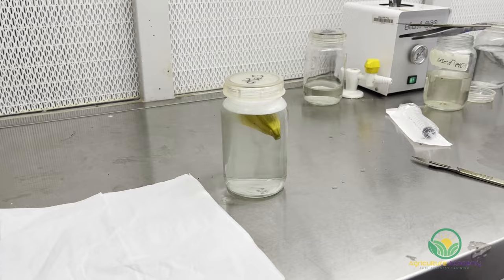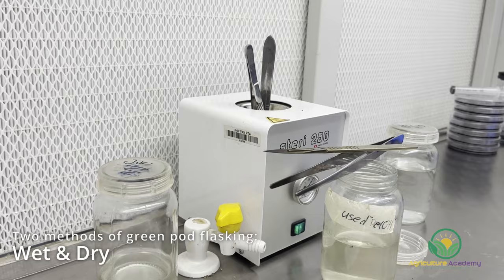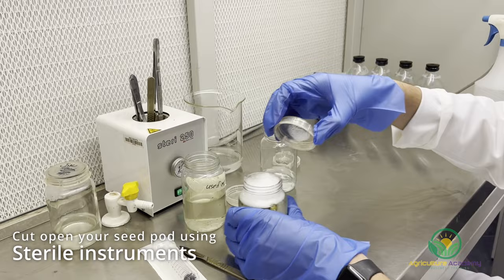In this video, we are going to show you two methods of green pod flasking, using dry seed and wet seed. For both methods, start by removing your pod and slicing it in half using sterile tweezers and scalpels.